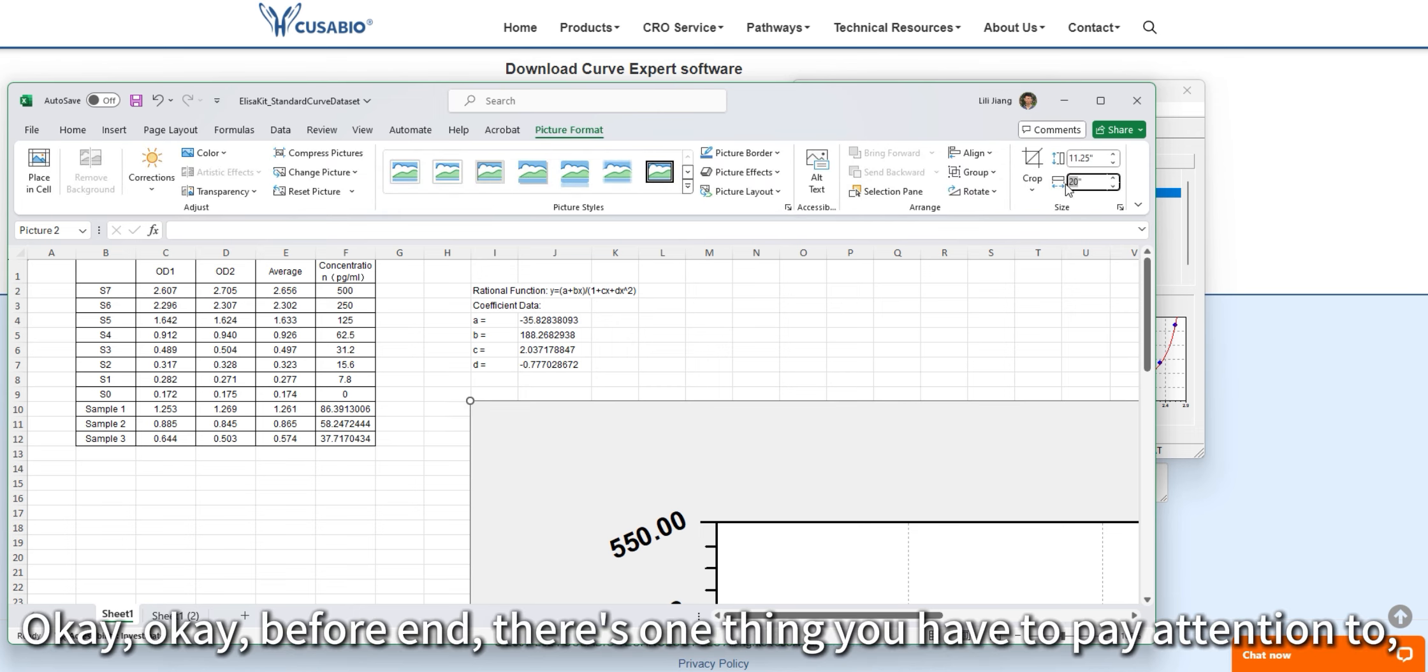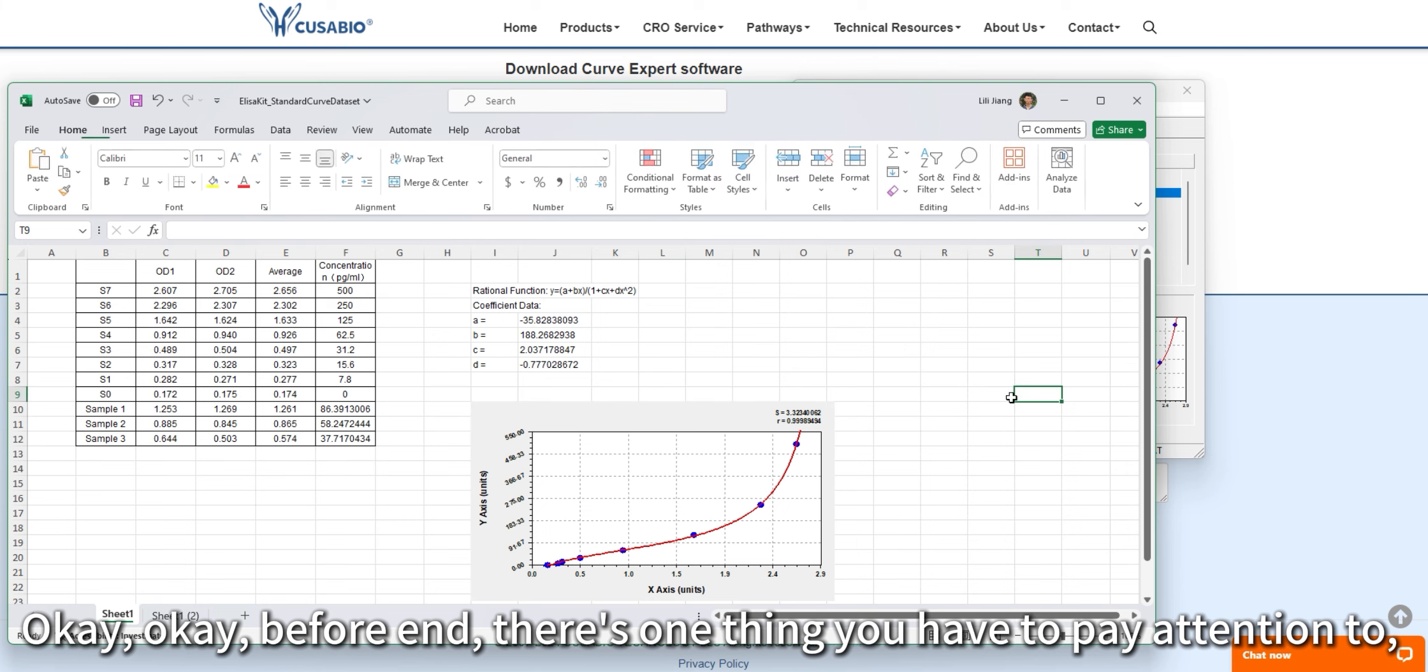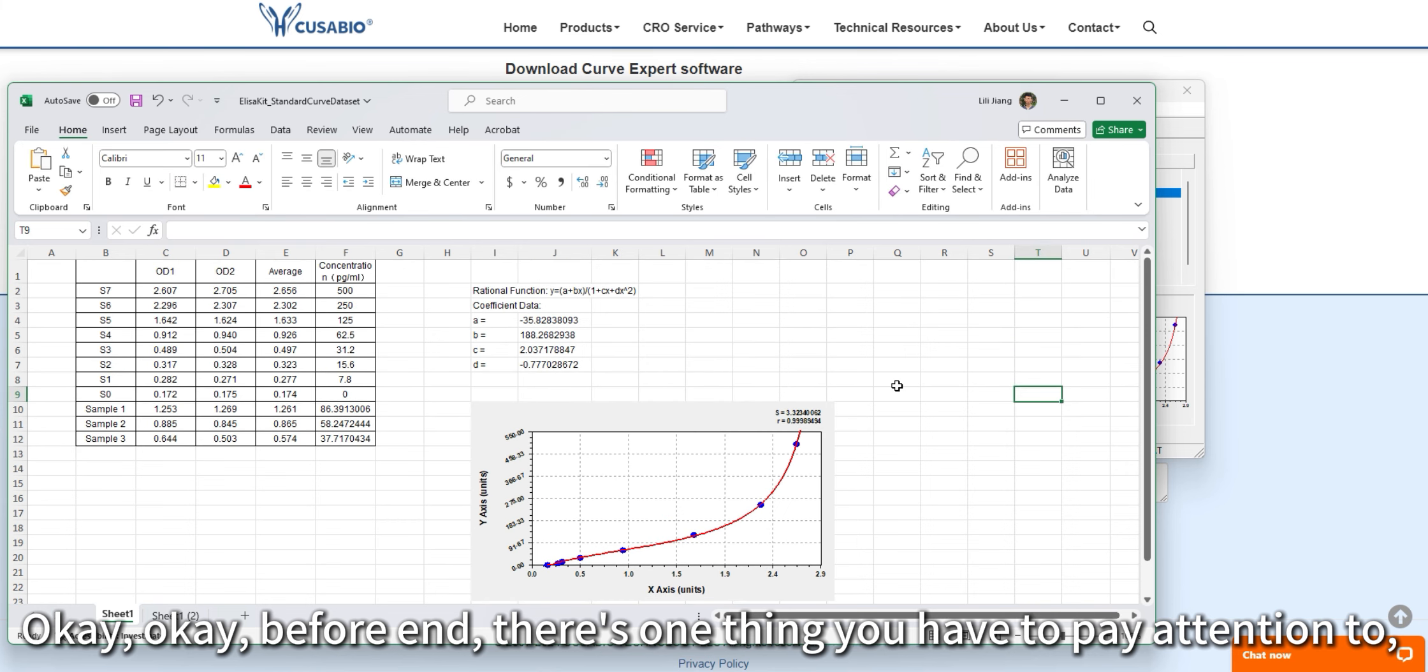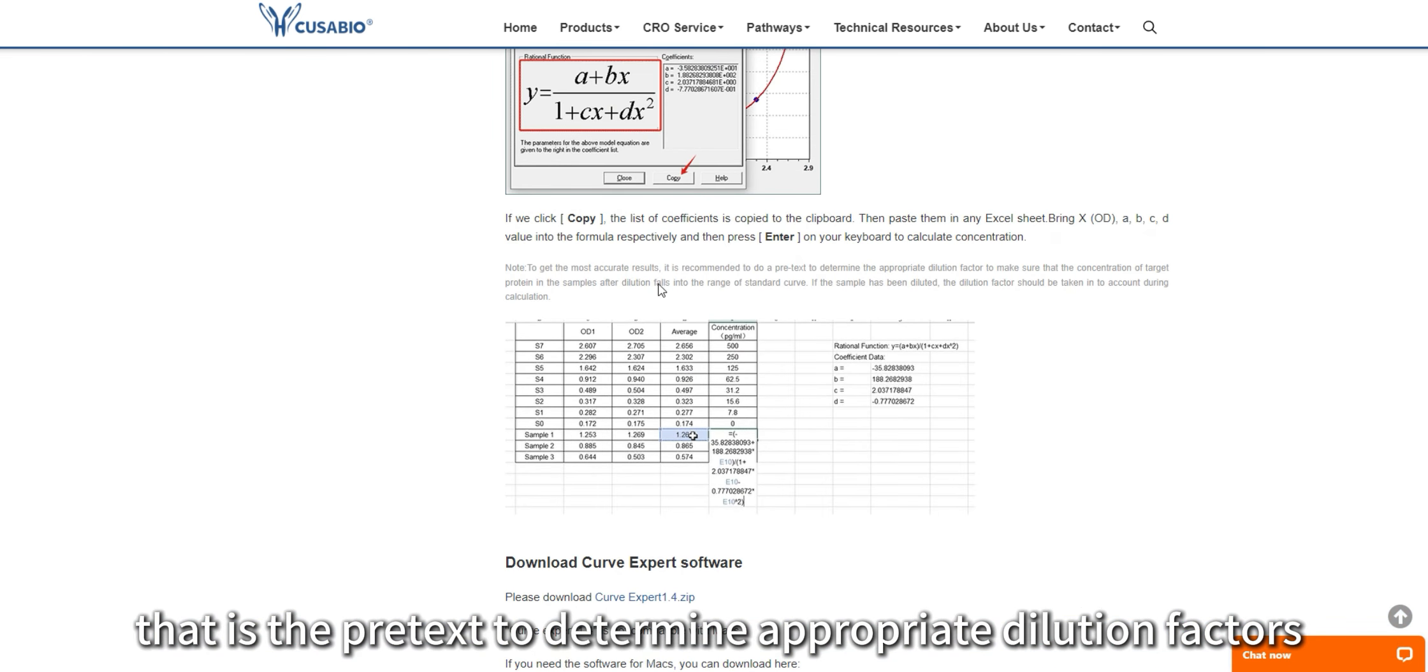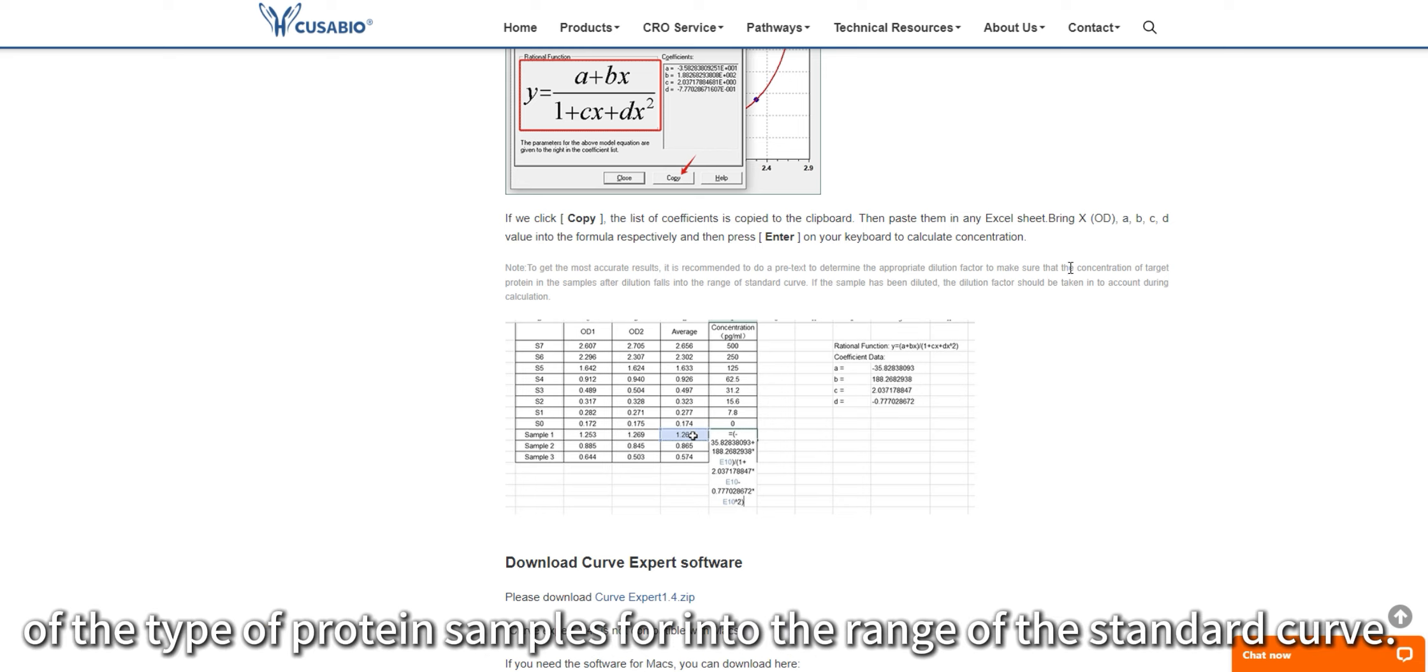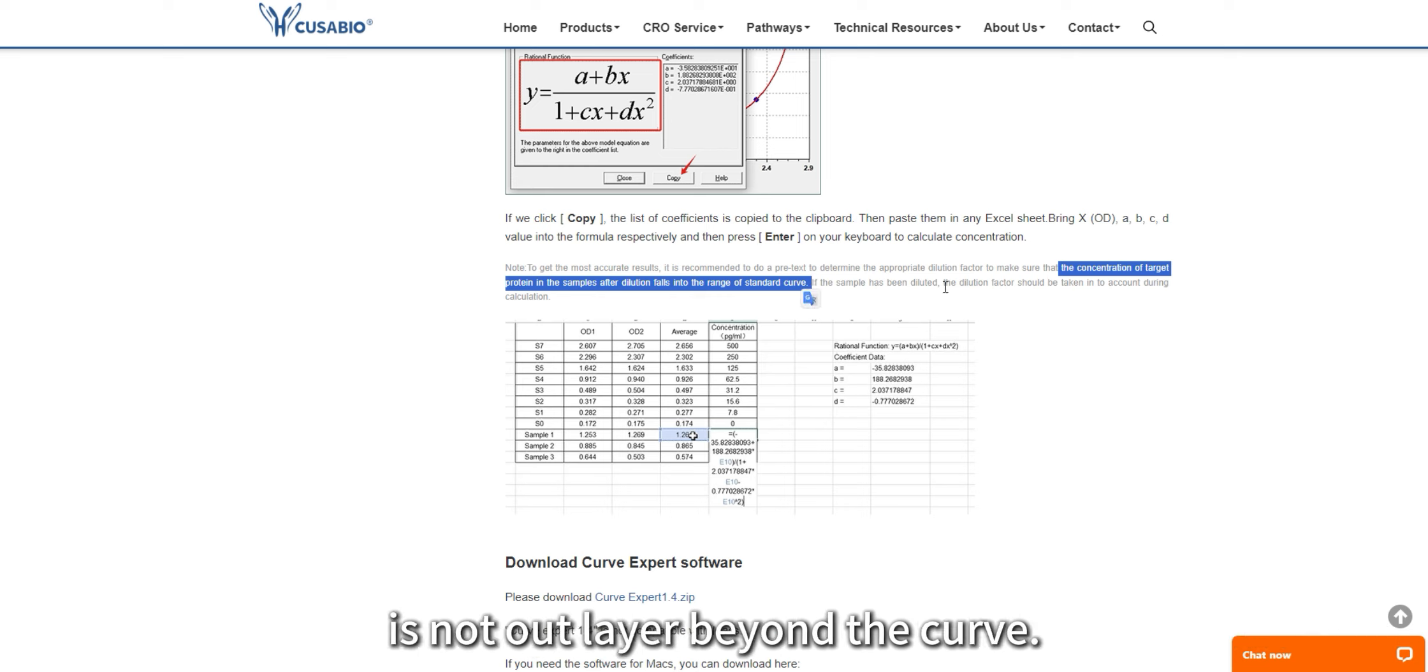Before we end, there's one thing you have to pay attention to: determine appropriate dilution factors and make sure the concentration of the target protein samples falls into the range of the standard curve, so the final results are not outliers beyond the curve.